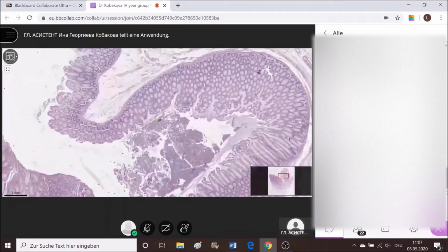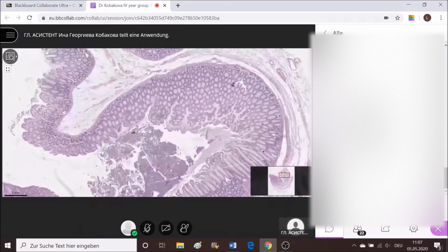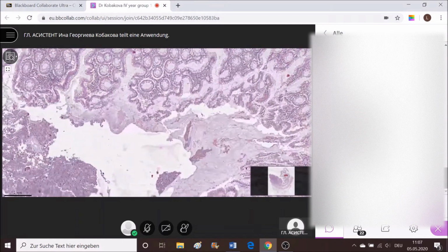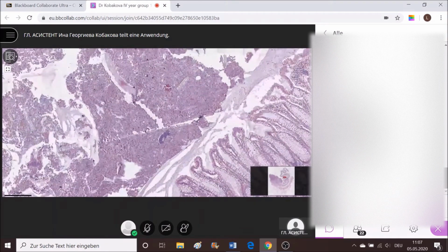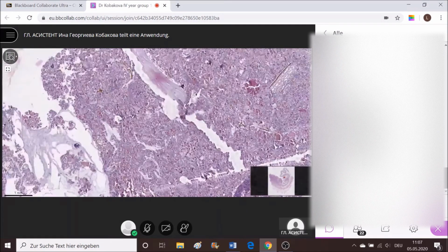Later we continue with a field which is suffering from increased excretion of mucin, and there is excreted debris inside the lumen here, along with some feces. Those darker fields here are actually remnants of food.